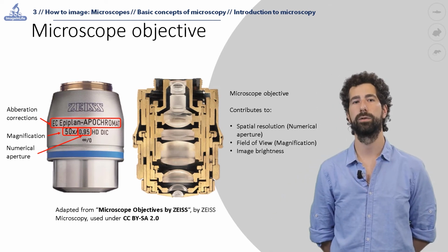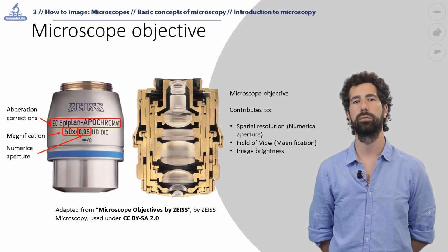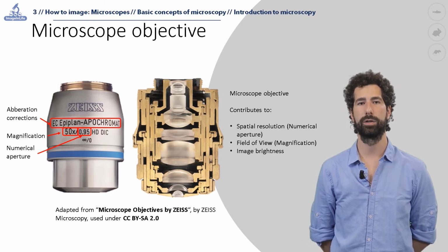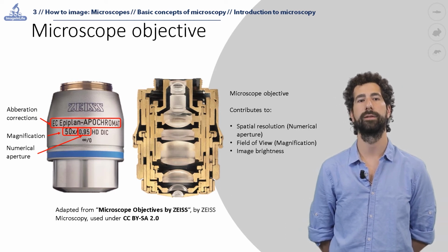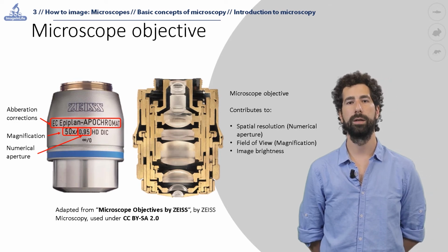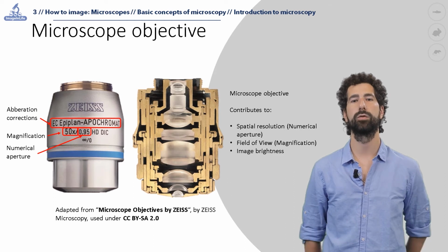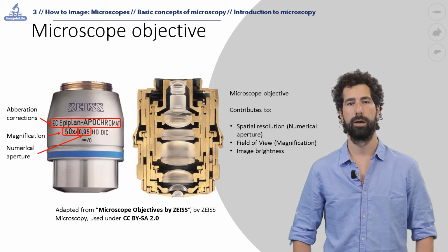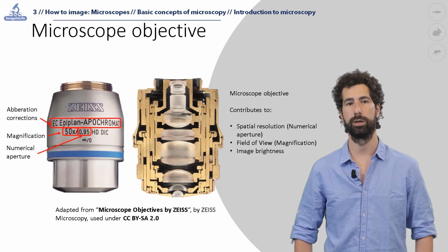Reversely, the numerical aperture also defines the focusing power of the objective, and therefore its ability to distinguish two points at the focal plane. For this reason, the numerical aperture of the objective normally defines the best spatial resolution achievable from the entire microscope. Commonly, increasing the refractive index of the medium between objective and specimen leads to an improvement of the numerical aperture and therefore of the spatial resolution. For this reason, one can find objective designs to work in different immersion media, like air, water, or oil.